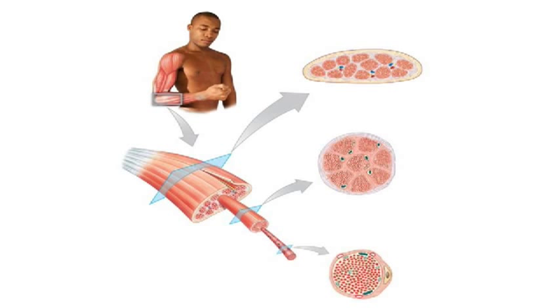You know, look for the nucleus. Wait, there it is. See that? There's the nucleus. If you see the nucleus, and if you see mitochondria, which we'll talk about, where'd they go? Yeah, mitochondria. That's how you know you're inside the cell, if you can see the nucleus and the mitochondria. Up here, see the nucleus? So you know each one of these things is a cell, so this thing must be a fascicle. Okay, so it kind of gives you a landmark, a signpost, to figure out where am I? Am I big or am I looking at something small? If you see blood vessels, you know you're looking at something really big.